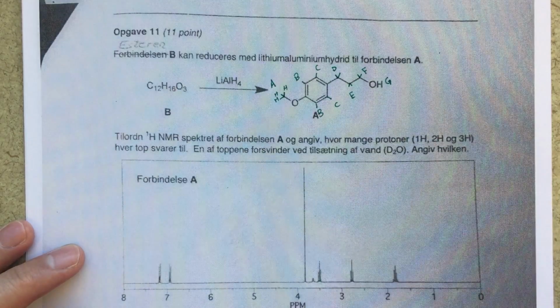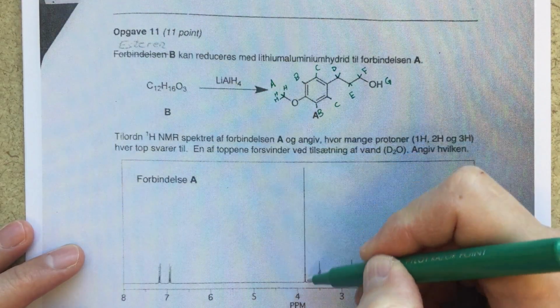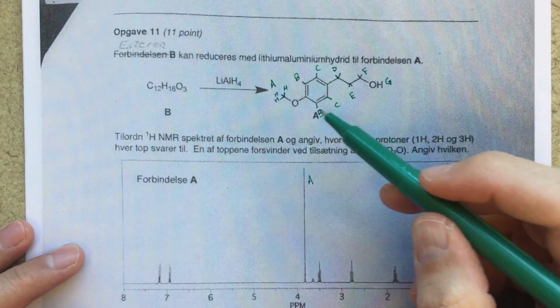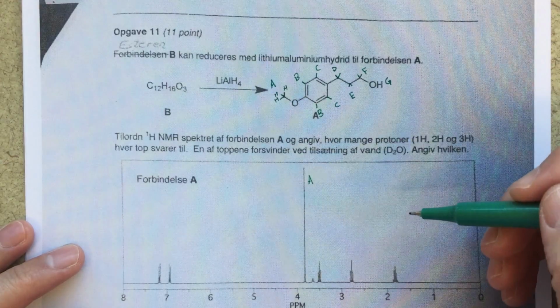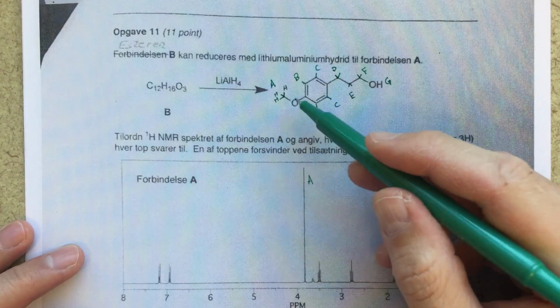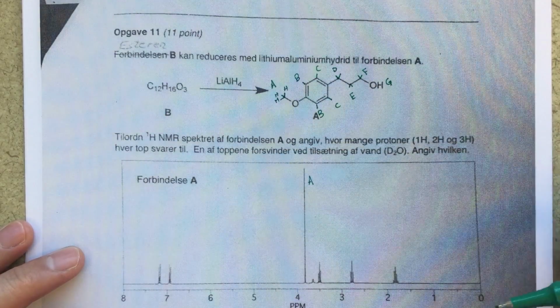Okay, so now looking at my NMR spectrum, I'm going to start assigning things. And right off, I see this pretty tall singlet, and pretty clearly I think that is A. This would integrate to 3. I've got 3 different protons. It should be a singlet. There's nothing adjacent, so it shouldn't be split by anything. It comes at about 3.8. That seems reasonable for this methoxy group, so that CH3 bonded to an oxygen. So pretty clearly, I think that that's A.